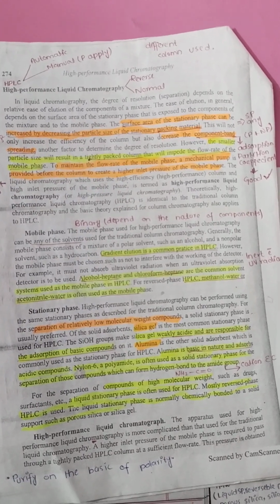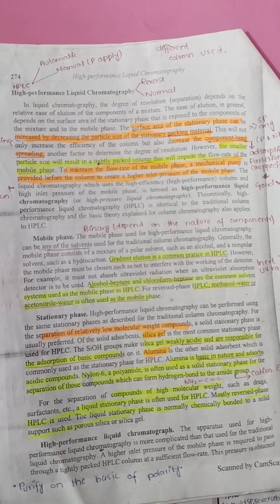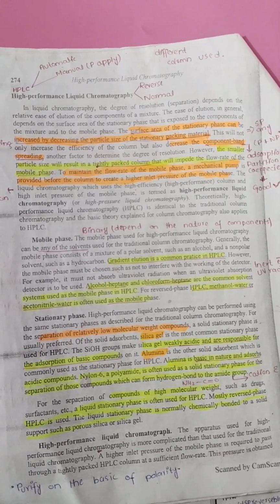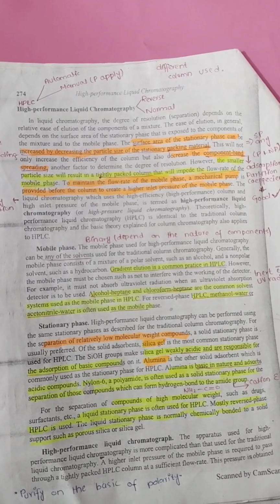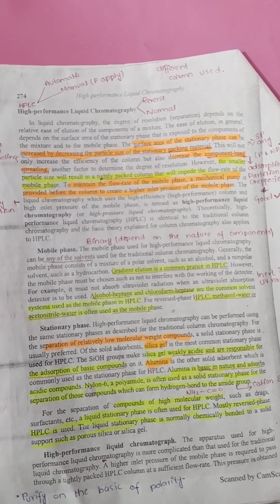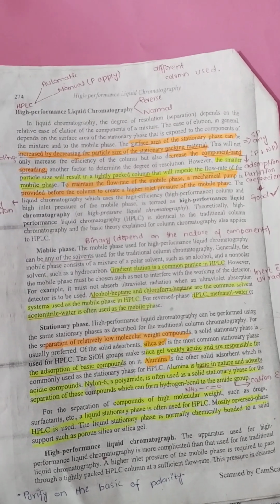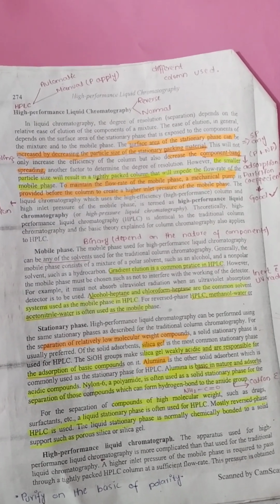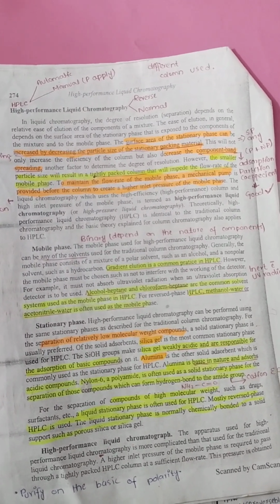Before going to the instrumentation or what is high performance liquid chromatography, we first discuss the purpose of this step, which is to increase the ease of elution. What is elution? Elution is a phenomenon in which the components separate from the mixture by moving through a mobile phase.